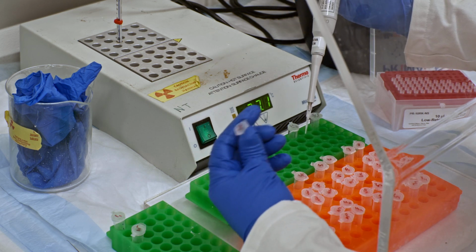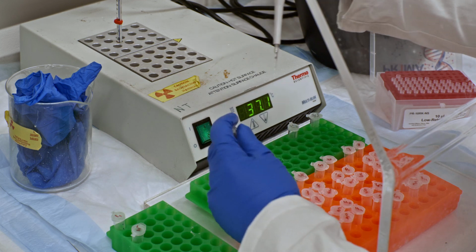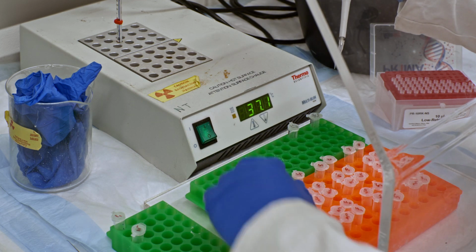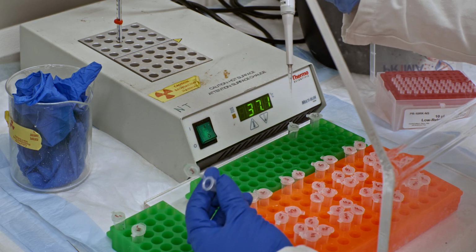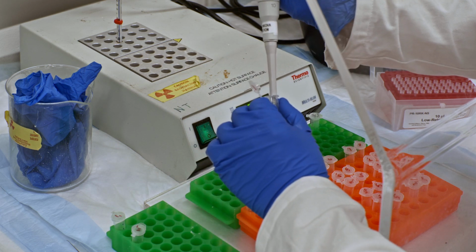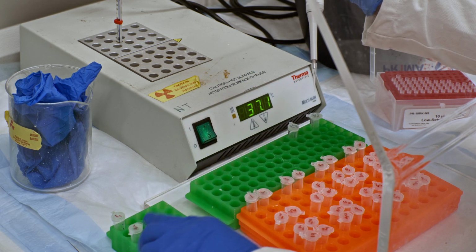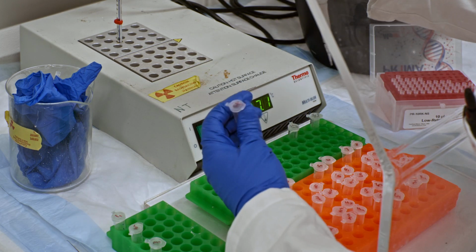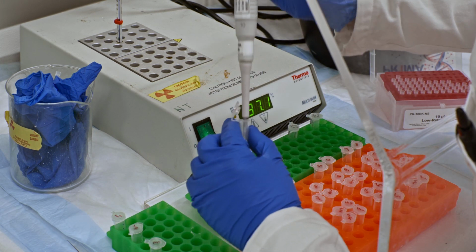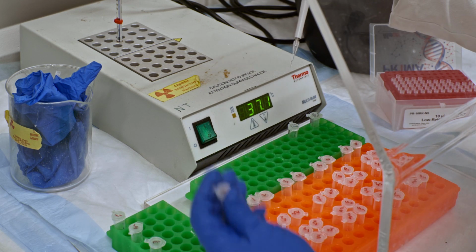Here, for example, I have reaction vessel 3. I'm going to take 4 microliters, and then I get 3,1, which is time 0 for me for my reaction vessel 3. Mix it up really well. Now I have an aliquot for time 0 for reaction vessel 3. And basically, I just keep redoing this for every different reaction vessel. And again, for me, everything with a subscript 1 is time 0.